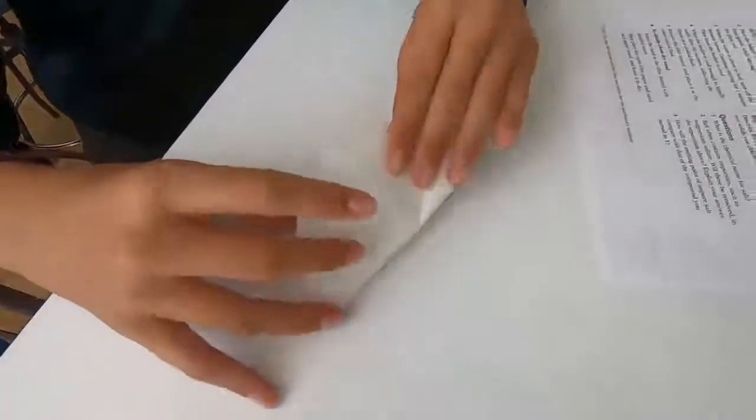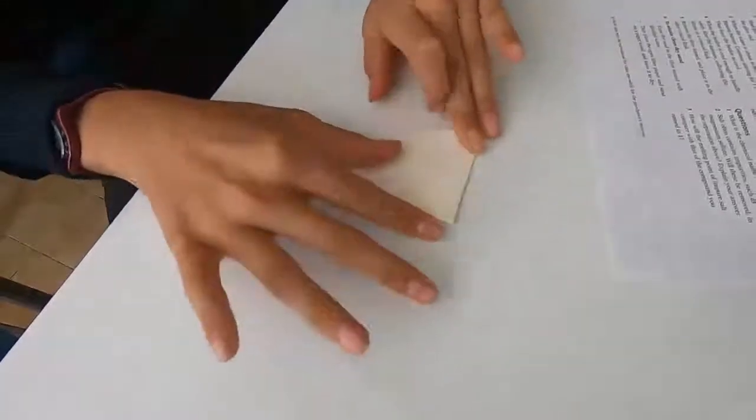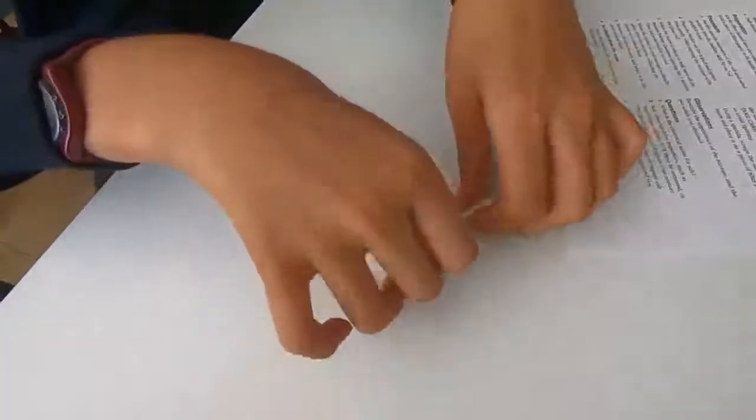The next process is to filter, and we're just going to show you how to fold a filter paper so that the filtering is more efficient. To make it more efficient you need more surface area on the filter paper when you're using it.